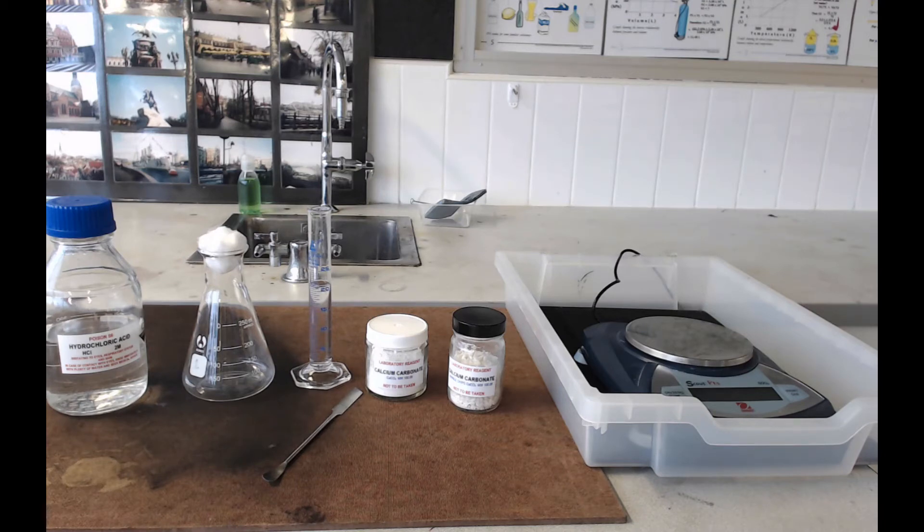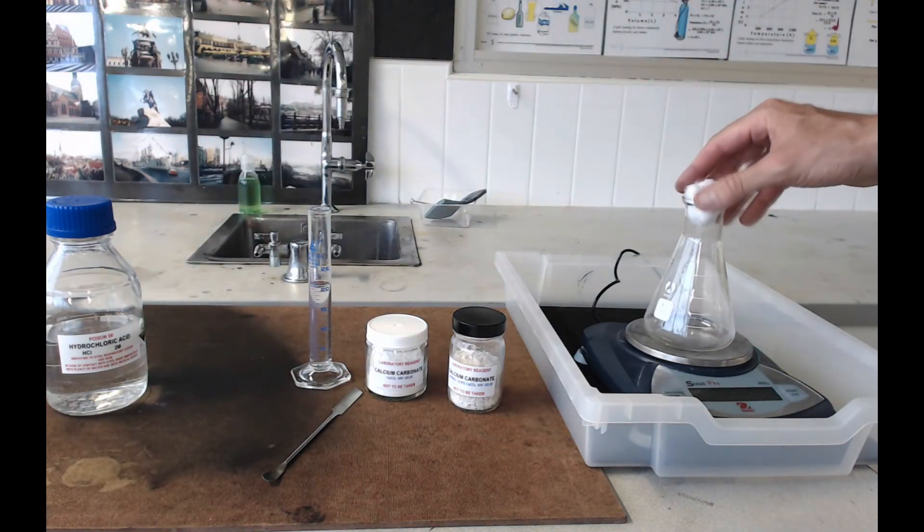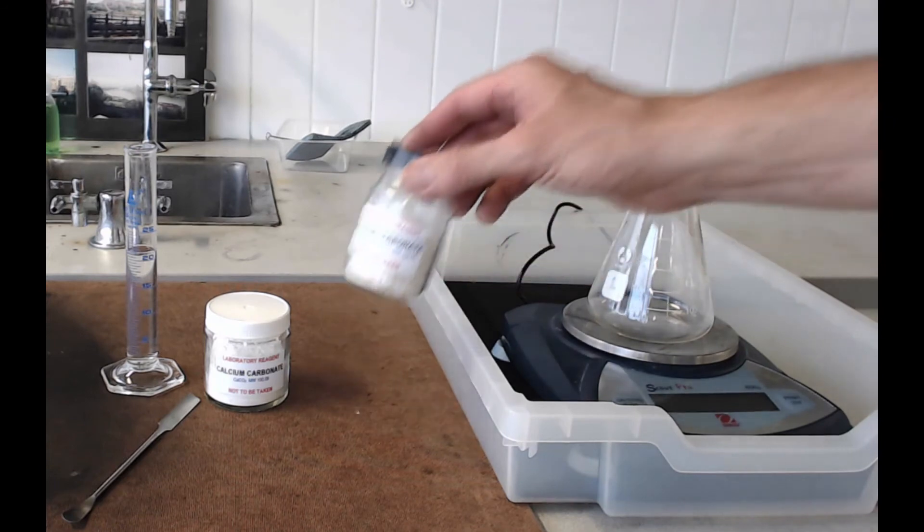Now the next thing you need to do is put your conical flask on the balance. It might be a good idea to reset this balance, because what you want to do now is take two grams of whichever calcium carbonate you're going to use first and weigh it out on the balance.